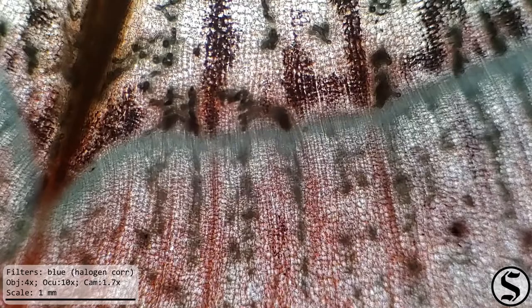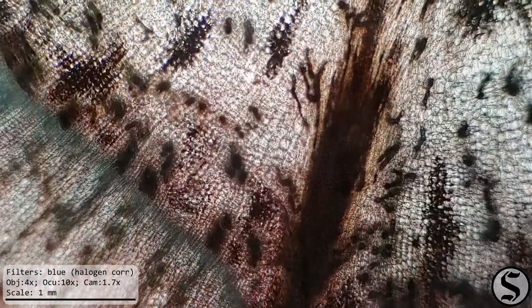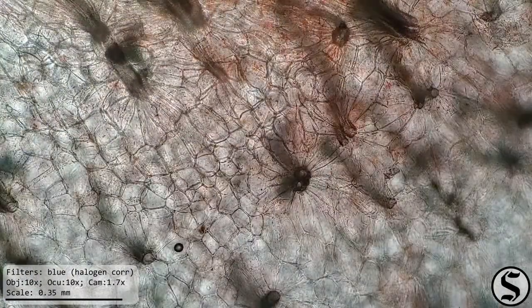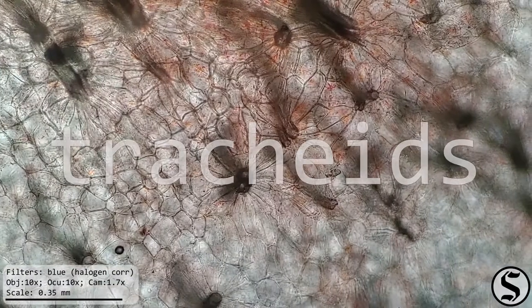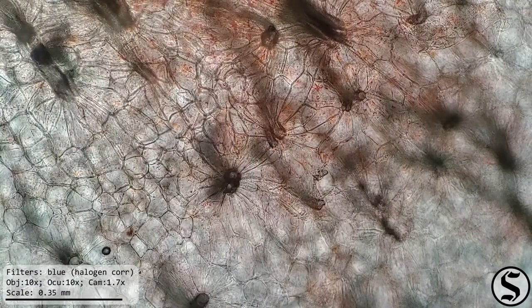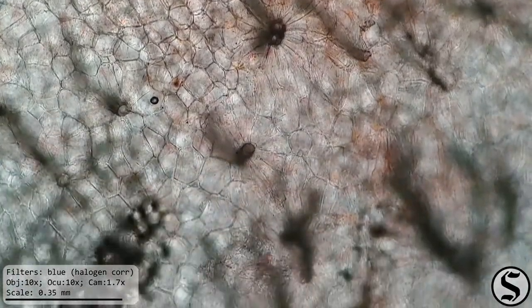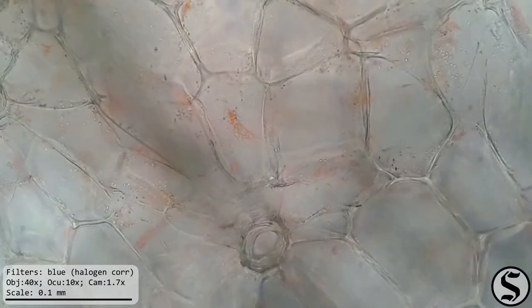You can see there are kind of three regions to the carrot slice. Let's have a look at that innermost region first. That's the xylem — the Greek word for wood — and that's what carries water and nutrients from the soil up to the leaves of the plant. You can see that it's relatively low in pigmentation; we can really see the cells in this part here. As we go up in magnification, you can get a good look at those tracheids — you can probably recognize that from the Greek 'trachea,' windpipe — those are the tubes that water will flow through up to the leaves. And at an even higher magnification, since our depth of field is so low, we can really follow those tubes by changing our focus. That's really neat.